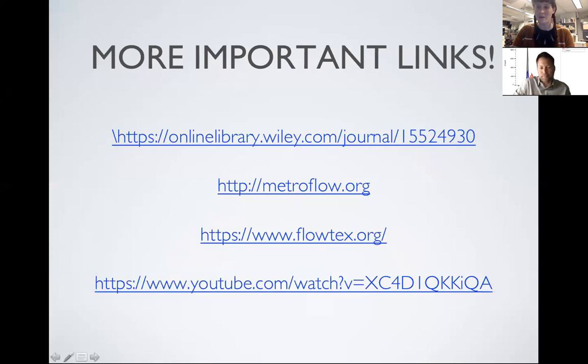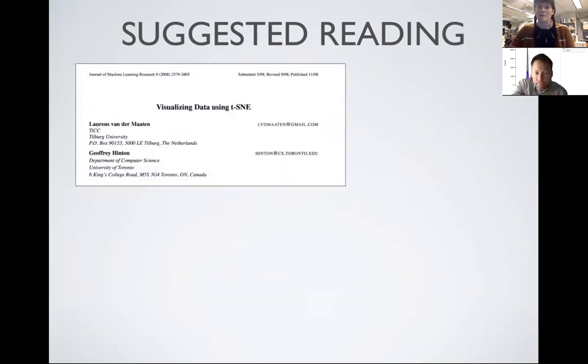Really quickly, just some suggested reading that we think would be nice for everyone as a resource from today's session. There's the original paper detailing how to visualize data utilizing t-SNE.